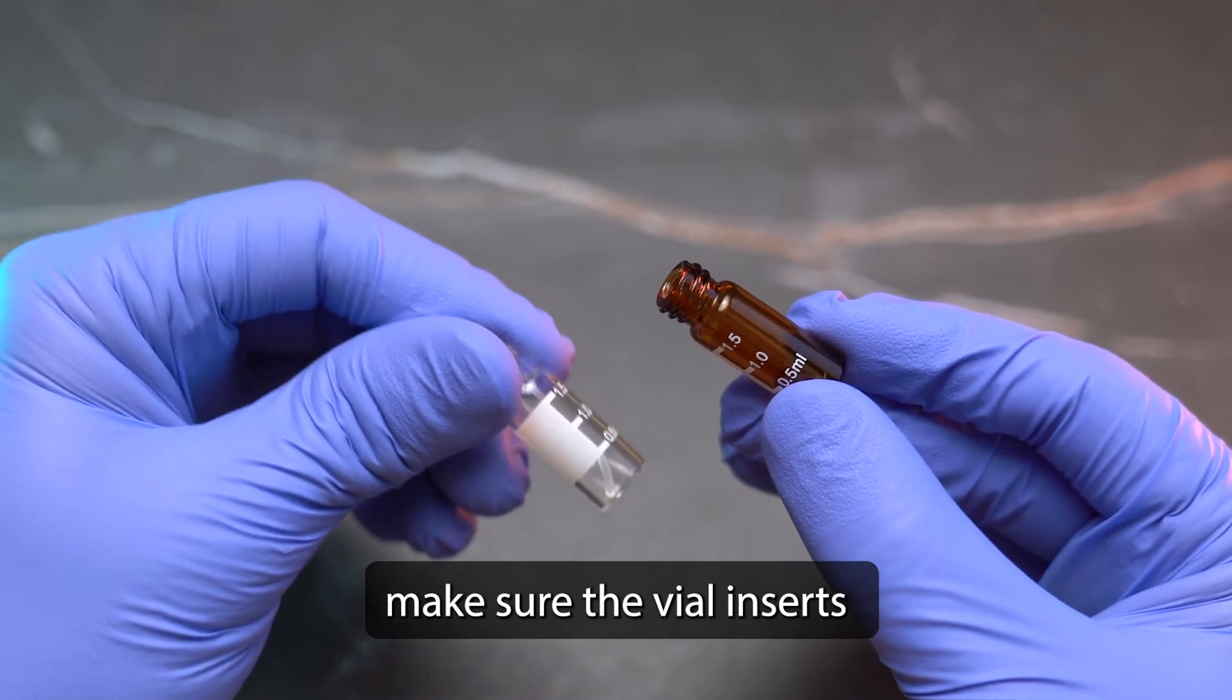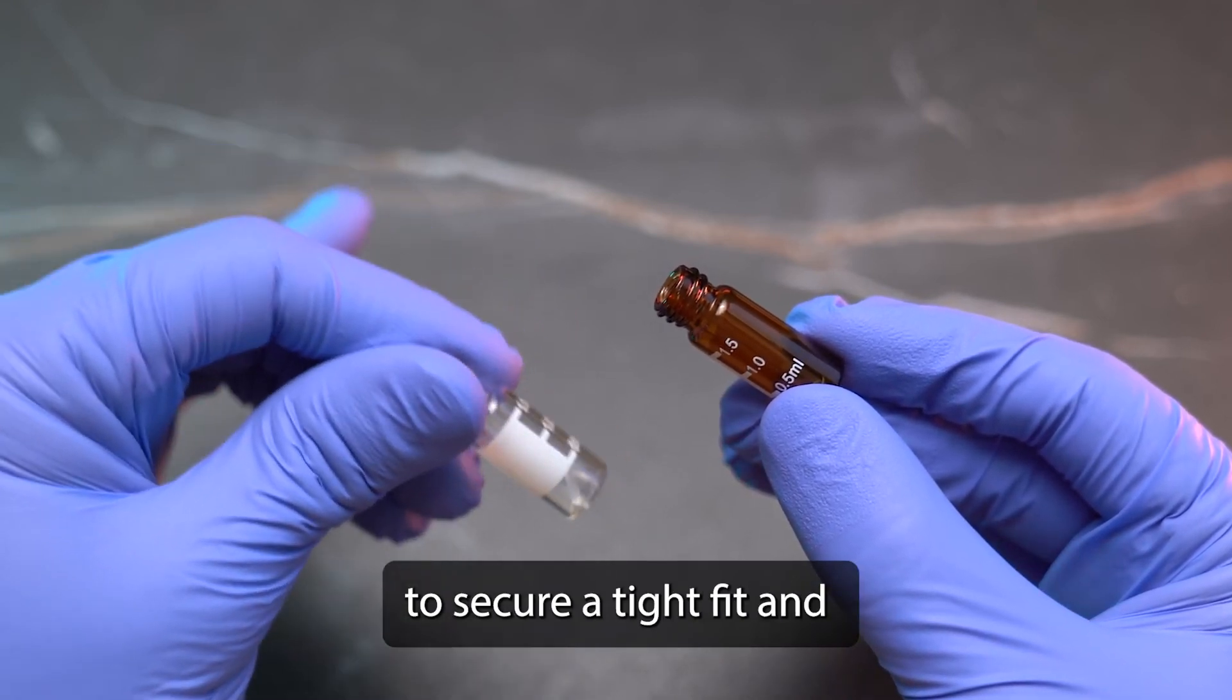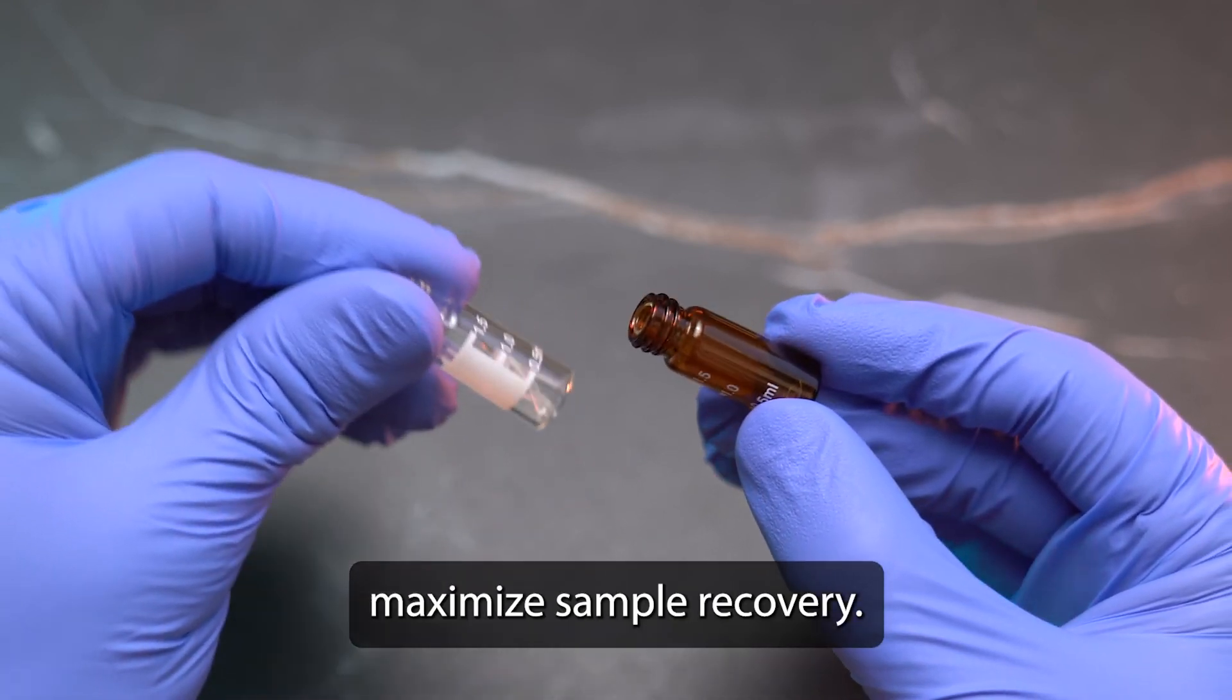Now, make sure the vial inserts are compatible with the vial to secure a tight fit and maximize sample recovery.